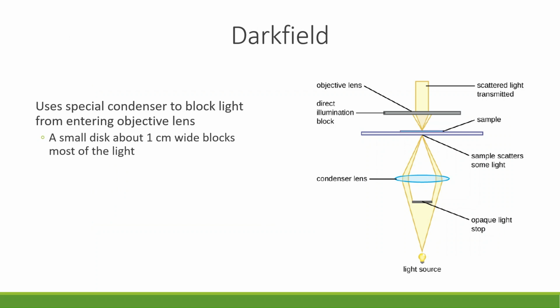Dark field microscopy is a type of light microscopy that contrasts sharply with bright field microscopy. In dark field microscopy, a specialized condenser is used to block direct light from reaching the specimen. This condenser includes an opaque disc that prevents central light rays from passing through, allowing only oblique light from the sides to illuminate the sample.